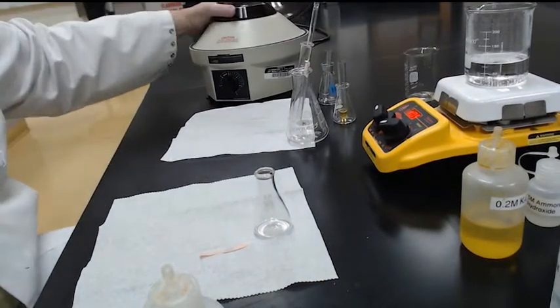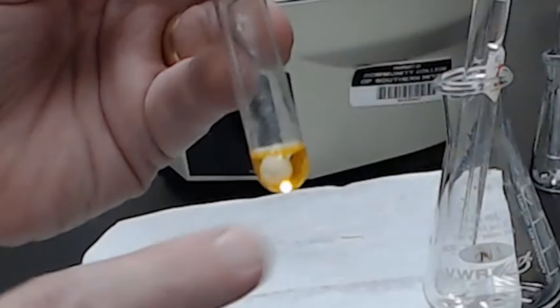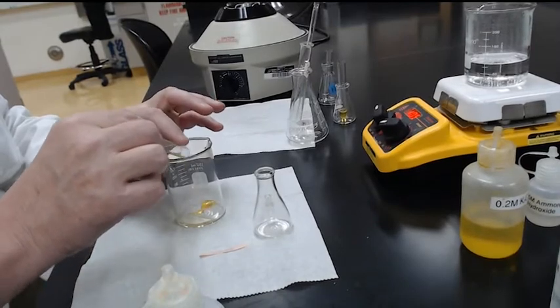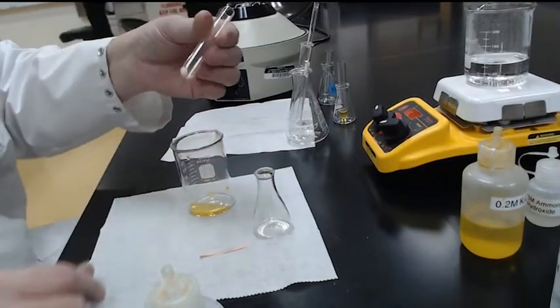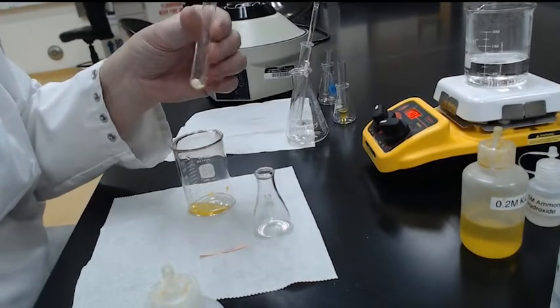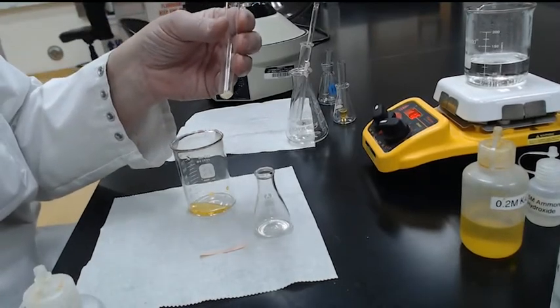Should do for round 1, and I'm going to show you a bullseye view, but you'll see the precipitate is much wider than it was before, and the supernatant is basically orange. We're going to discard the supernatant again, and by the way, this chromium liquid must be put into hazardous waste. Okay, now we're going to do one more wash just to remove any last traces of yellow that we can from the possible barium precipitate.